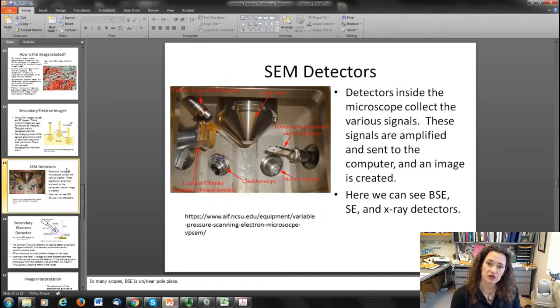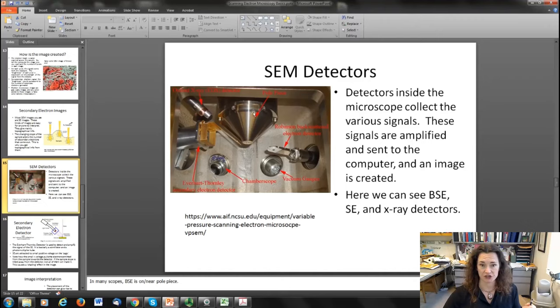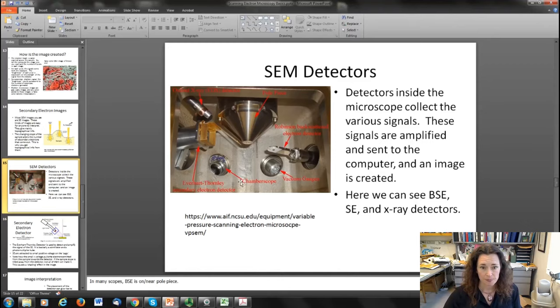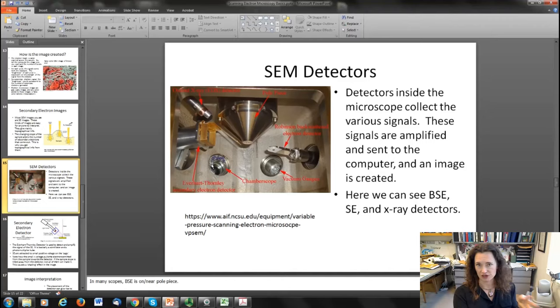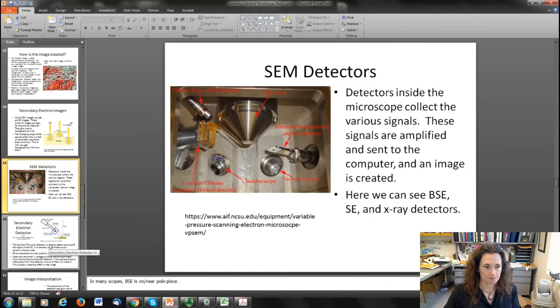If you look inside a typical SEM, you can see all the detectors from the various signals. The pole piece is where the electrons actually come out of a small pinhole. You can see the other detectors inside — the backscattered electron detector, which you move into place over your sample between the pole piece and the sample when you want to use it. There's also an Everhart-Thornley secondary electron detector, an x-ray detector, a little chamber scope with an infrared camera so you can see inside and make sure your sample is positioned correctly, and vacuum gauges to make sure you're at pressure.